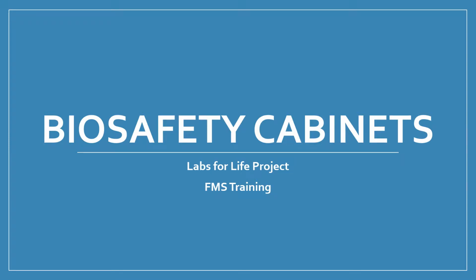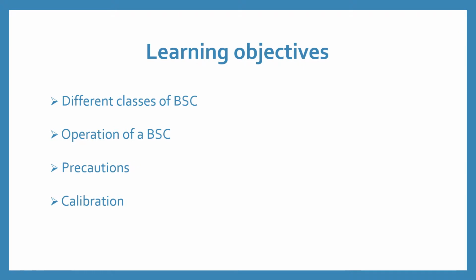Biosafety Cabinets. Learning objectives: the different classes of Biosafety Cabinet or BSC, the operation of a BSC, the precautions to be taken when using a Biosafety Cabinet, and calibration.